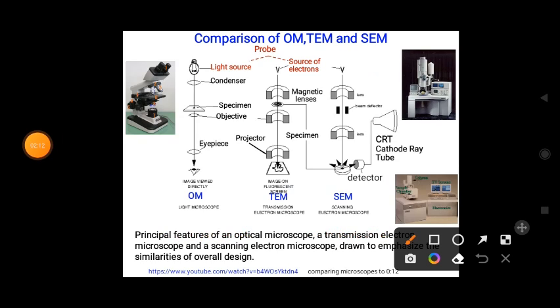Also, the objective lens focuses the electron beam diameter to a nanometer scale. The electron beam then hits the surface of the specimen and a number of electron signals are produced. These signals are then detected by the appropriate detectors.